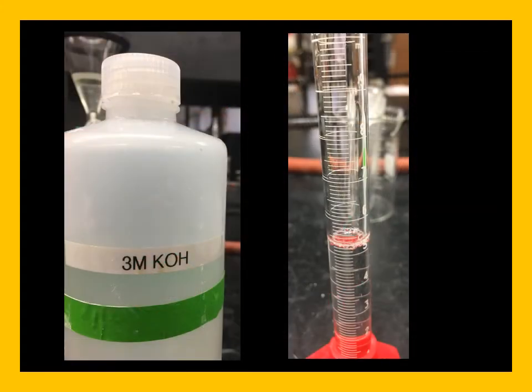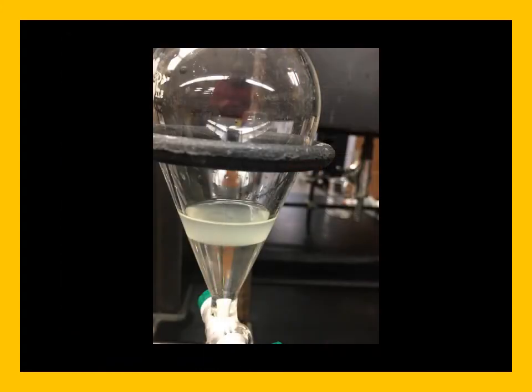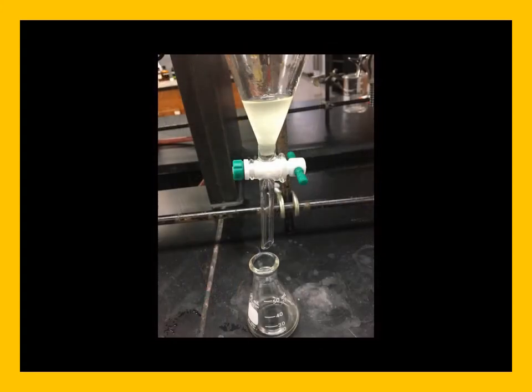I'm now going to add 3 molar KOH. You can see there's about 5.2 mils of 3 molar KOH. When we add this, you can now see that the aqueous layer has also become larger. I'm going to shake the separatory funnel well, which I could not do while I was photographing it, so you don't see that. Allow the layers to settle.